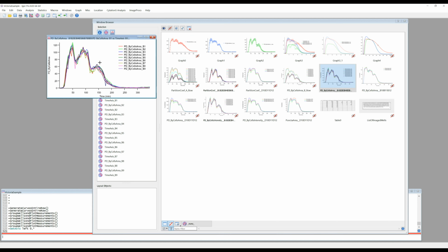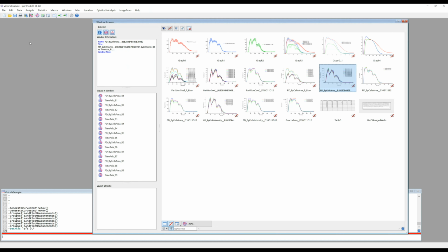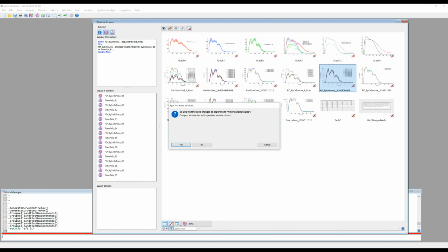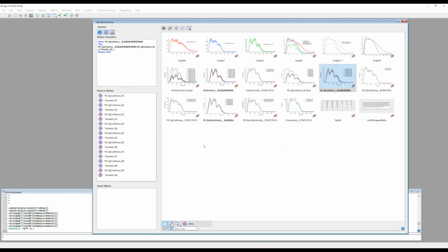to show you how to make modifications to a graph and do some other simple calculations such as averaging and normalization. And I want to do that using heat shock data from Racciata. That would be a nice quick repetition of the steps of the workflow. So I'm going to make a new experiment for that.